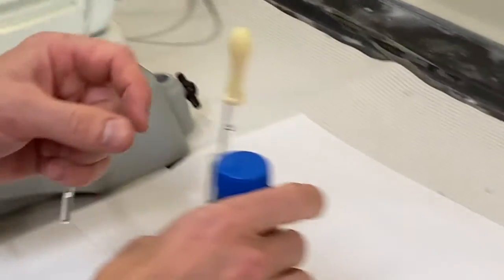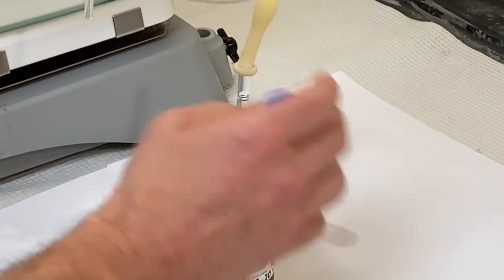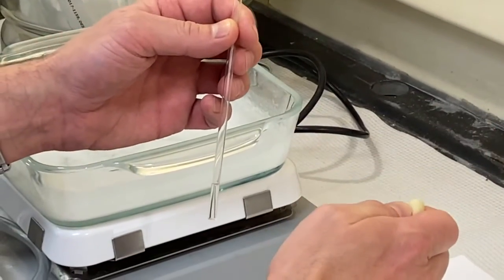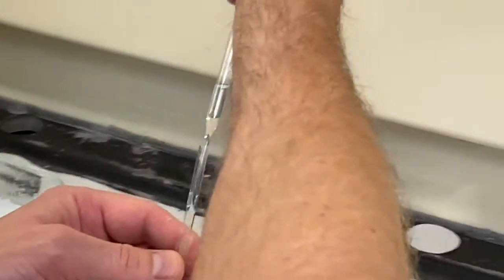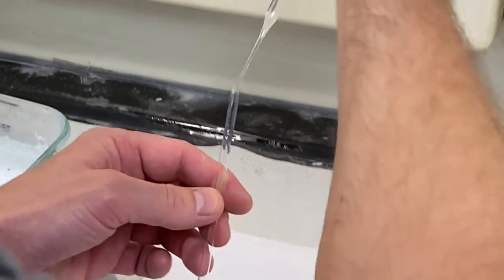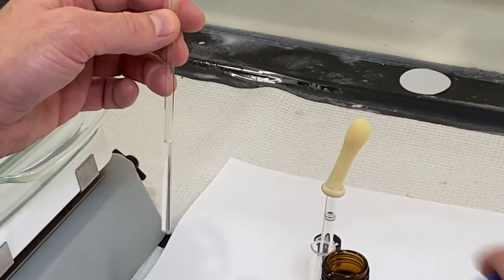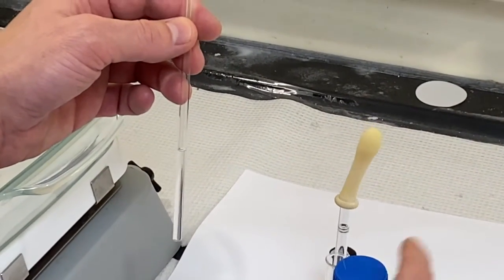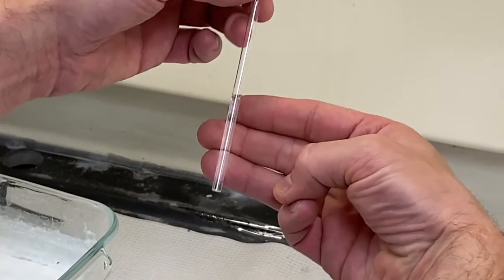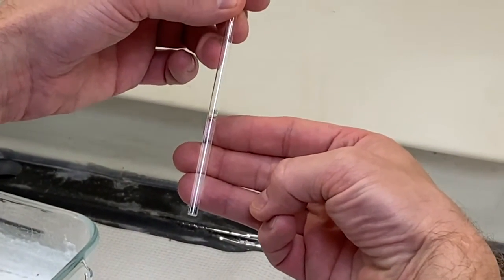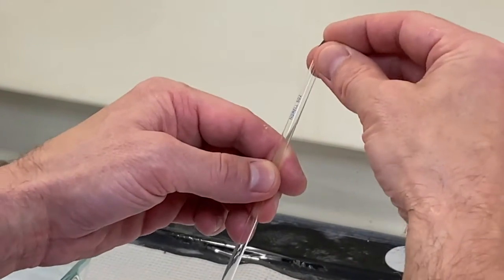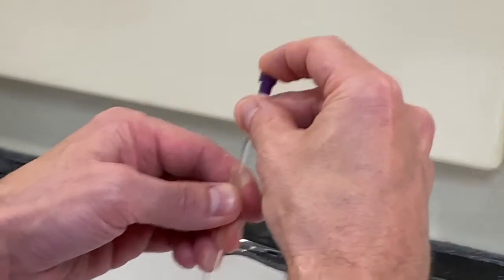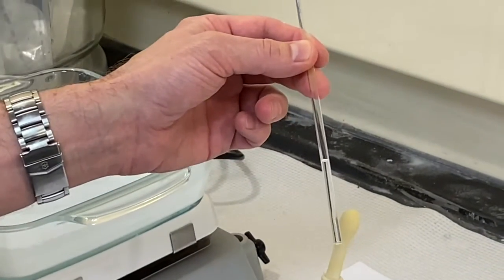Then you're going to add deuterochloroform slowly and carefully to get to a total height of about four centimeters in the tube. You might want to use a ruler the first time you do this. After a while you'll get pretty good at it and you can just eyeball it. A good rule of thumb is three fingers. That height is about the right height. Then you cap the tube and you're ready to go into the instrument room.